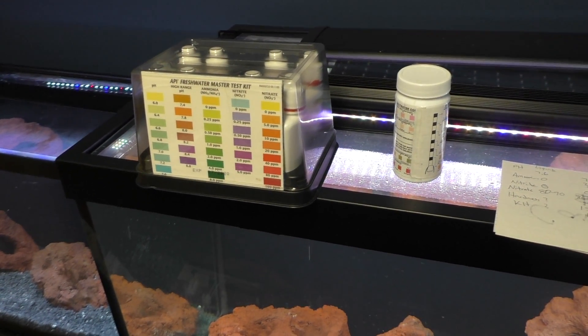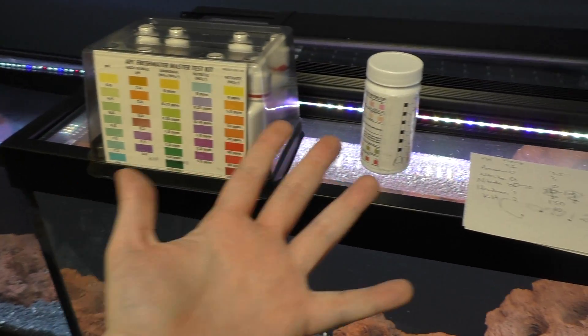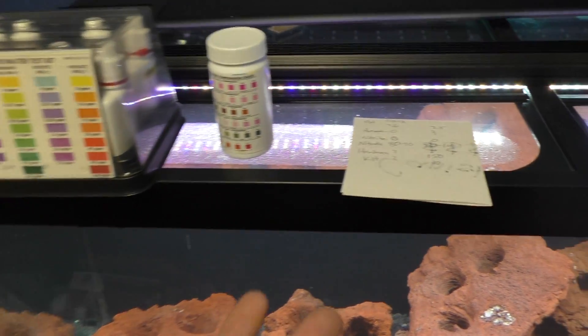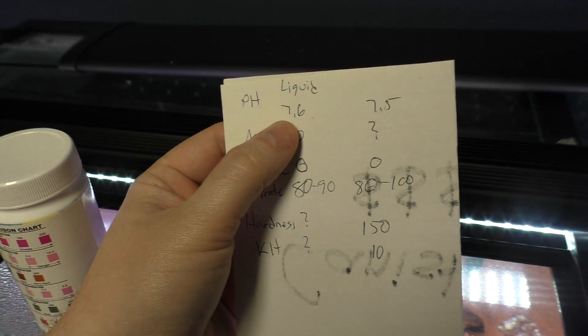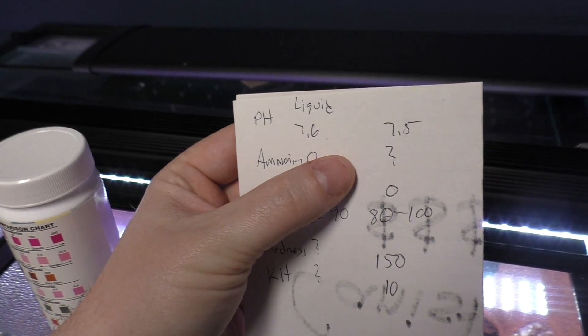So here we go — we had the shootout: API Master Test Kit versus the Tetra six-in-one strips. In a side-by-side comparison, trying to be as non-biased as possible, pH was 7.6 in the liquid kit and 7.5 in the test strip.